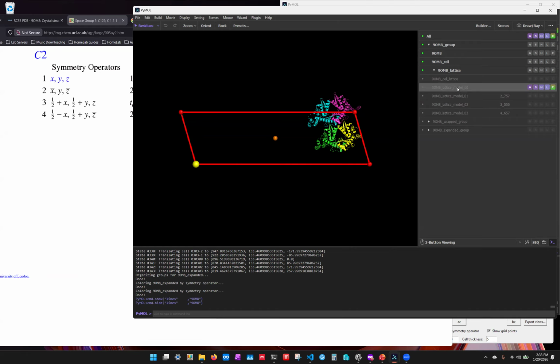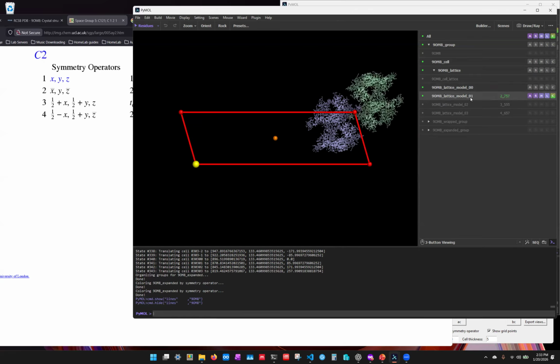So let me show you. For example, let's get rid of this. So the P1 operator gives us this. No change. Now we have the second operator, which I think means flip along the x direction and then flip along the z direction in a mirror plane. So 2 mirror planes cancel out, and what you end up having is that. Is it a reciprocal when we say flip? I think it literally means reflect.